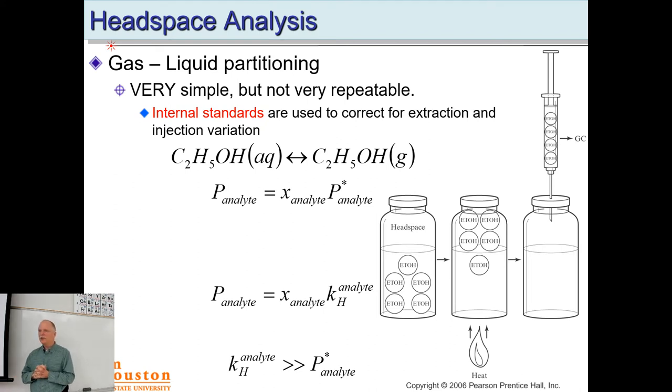These were gas chromatographs. And guess what the detector was? Students. And so they would train students on these olfactory standards. They would inject a standard that had four or five different smells in it. The student had a mask on, and they had a little knob of a diluent gas. As soon as they smelled something, they turned the knob. And essentially the knob was always electronically turning down, right?